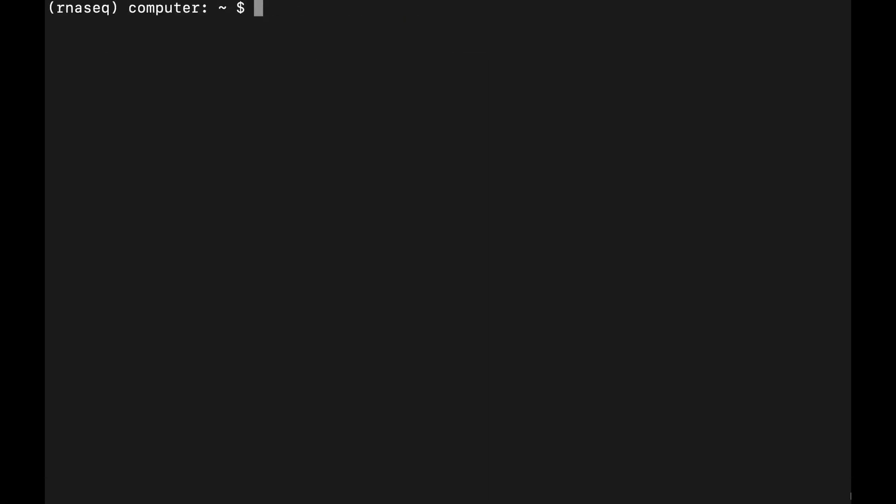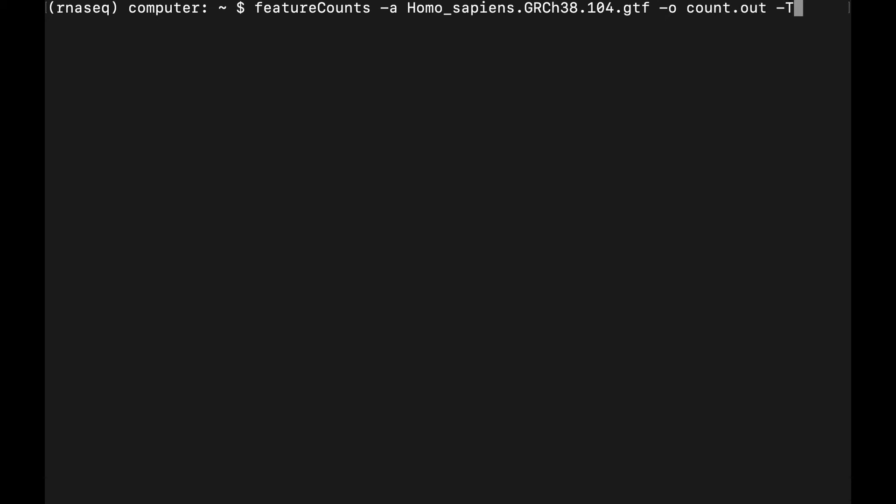So the actual process of running this is pretty straightforward and simple. We just do feature counts. We point to the annotation file. We point to an out file. We'll just call it counts.out. I'm going to add a couple threads just to make it faster, so I'm going to add eight threads.